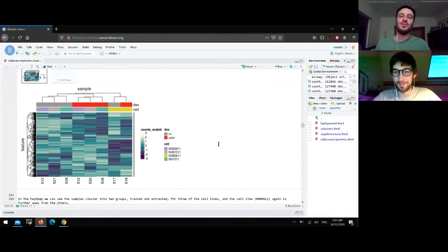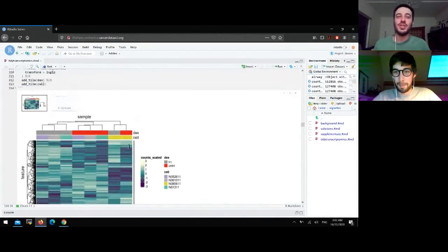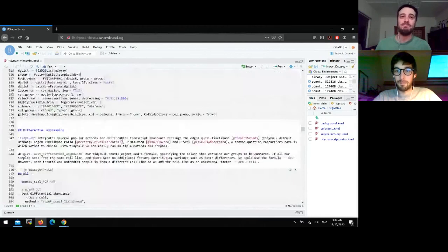Okay, yeah. Thanks. And talking about colors, these are the default colors, but you are free to change the colors for any of those layers. So the heat map layer and all the annotations as well. You can provide palettes that the colors will be picked from.